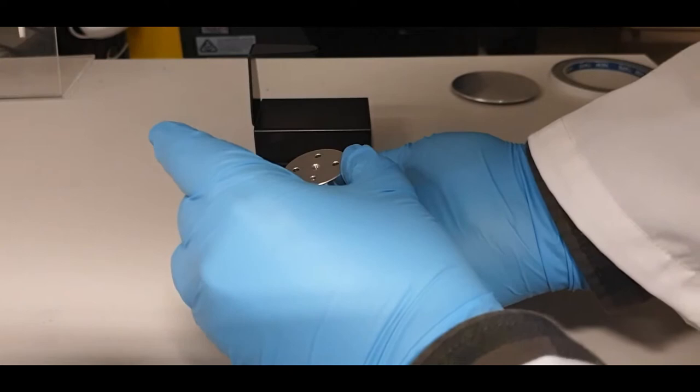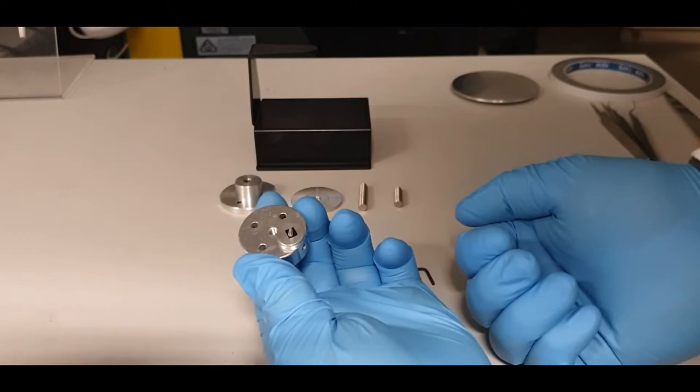If you feel brave, you can turn it upside down to make sure that your sample does not fall off and the pin stub does not fall out.